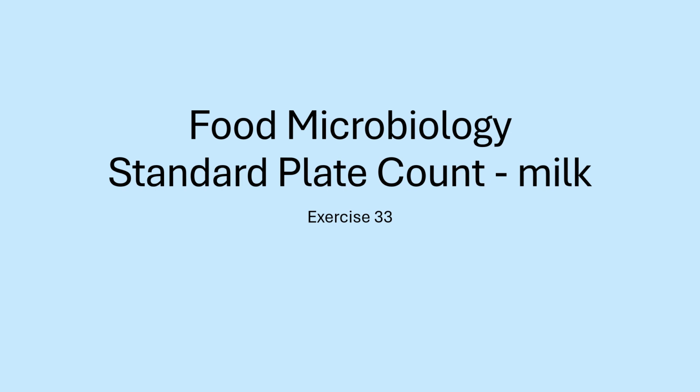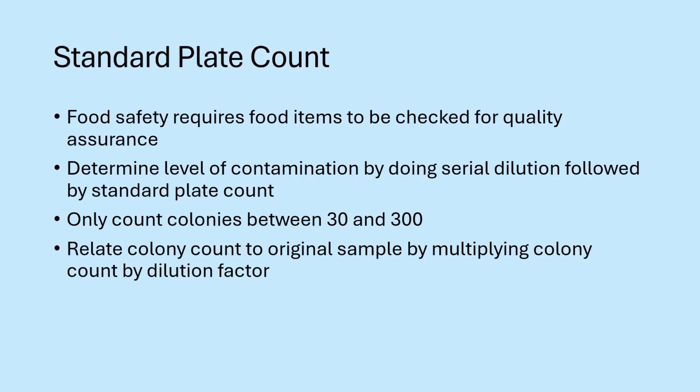This is the last of 4 separate experiments dealing with food microbiology. Previously, there was one done with standard plate count procedure where we were looking at food items such as potato salad. In this one, we're looking at milk. What we're wanting to do is see what is the bacterial load, or basically how many bacteria per milliliter are in the milk sample.